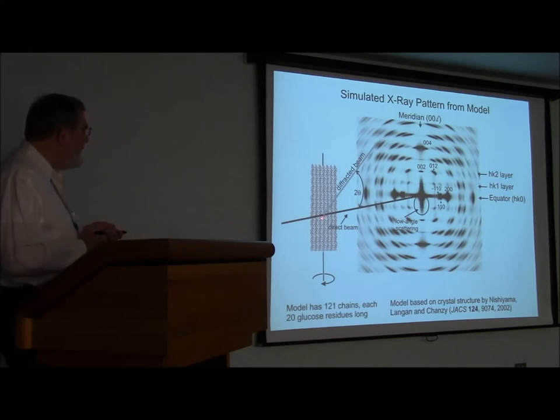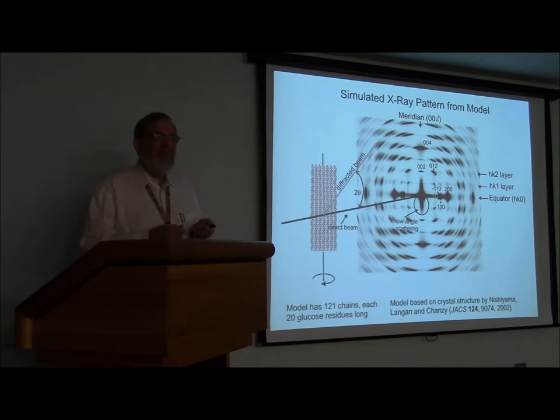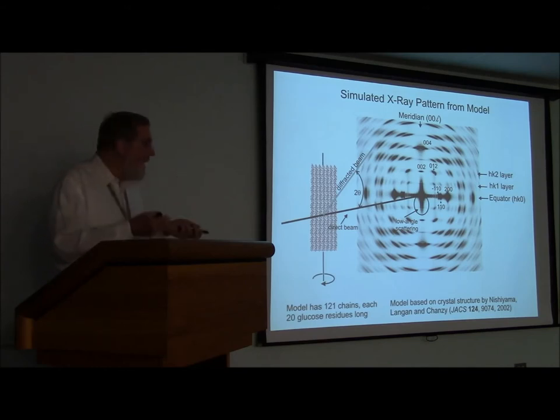But some of the intensity goes off as a diffracted beam and makes these individual spots here. The basic idea of this phenomenon is that each of the atoms is excited in the crystal, and when they are excited, then they fall back to a lower energy level and each give off their own X radiation at the same wavelength. And this radiation is broadcast spherically from each of the atoms, but these spherical waves going out create interference, both positive and destructive interference, and so you end up with spots. And the more atoms that you have in a nice regular array, the better the contrast is between the radiation that's being scattered and interacting positively or negatively, destructively, and so you get a sharper and sharper pattern with a bigger and bigger crystal.